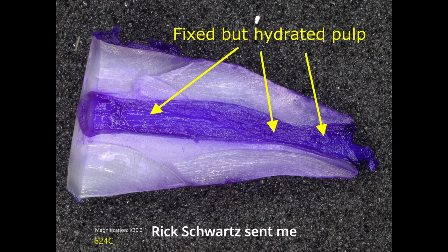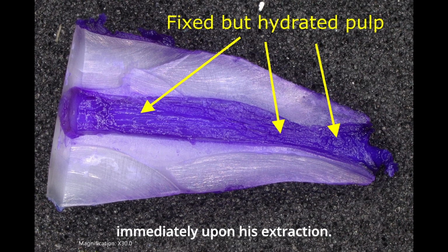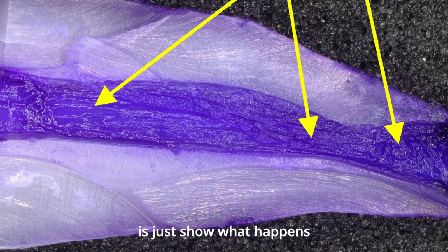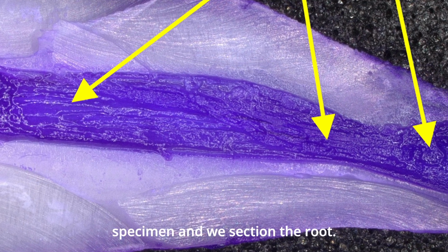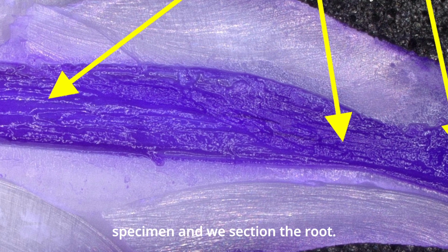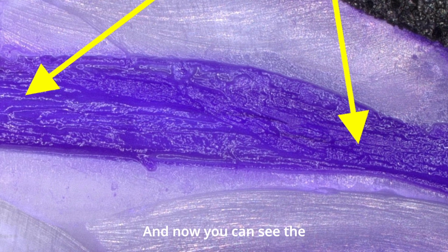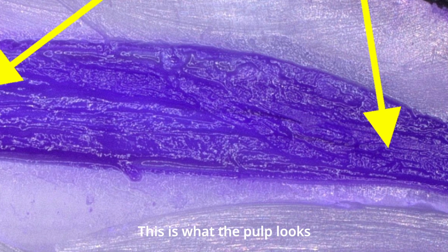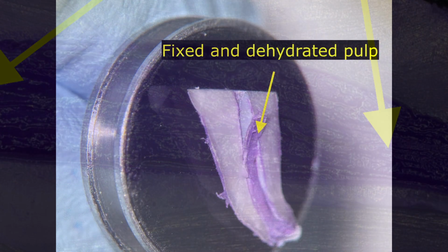As an example, here are some teeth that Rick Schwartz sent me that were fixed immediately upon his extraction. So what I thought I'd do is just show what happens when you take a fixed specimen and we section the root. And now you can see the fixed but hydrated pulp. This is what the pulp looks like when you section a root that's been fixed but not dehydrated.